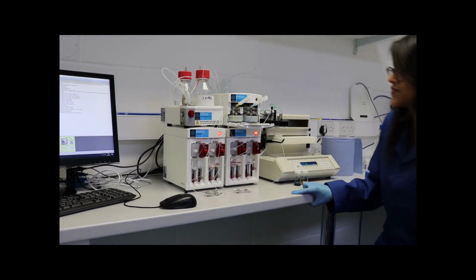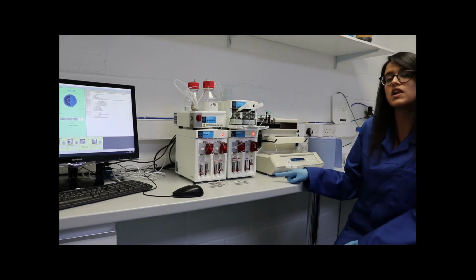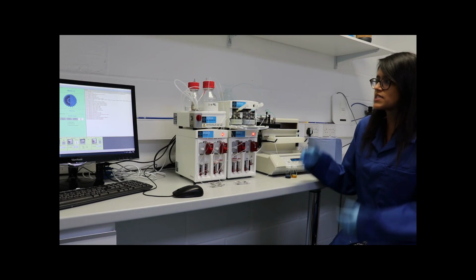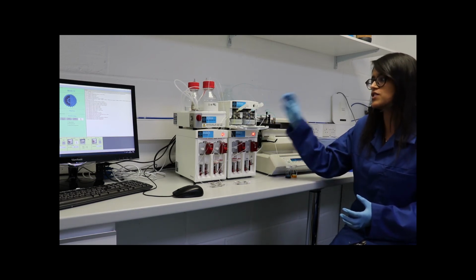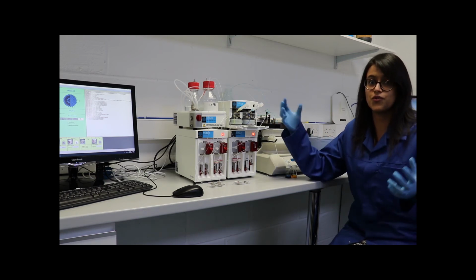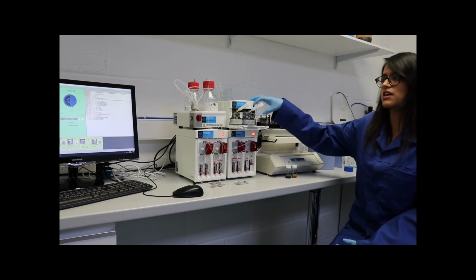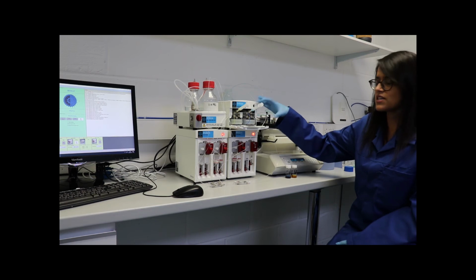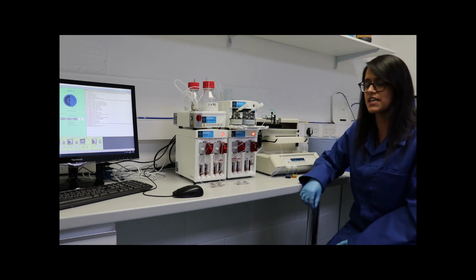And now we're waiting for the lines to be washed. So you can see where we had fluid that was colored in the fluidic line. That's all been removed. Some may be wondering, what does that mean? What happens to the dye that was loaded for all 4 experiments? The wash cycle usually washes everything else without disturbing the sample loops at this point. So they remain intact, so the next one will begin shortly, and that will release the next set.